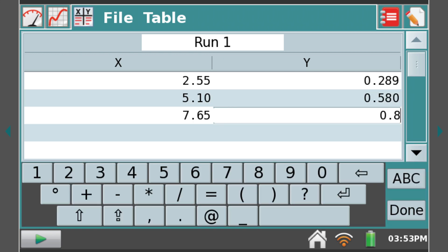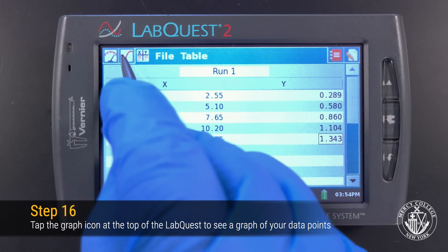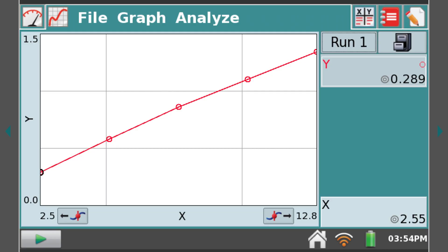Enter the remaining concentrations and absorbance values for your standards from your data sheet. Click Done, and then click on the Graph tab at the top of the LabQuest to see a graph of your data.